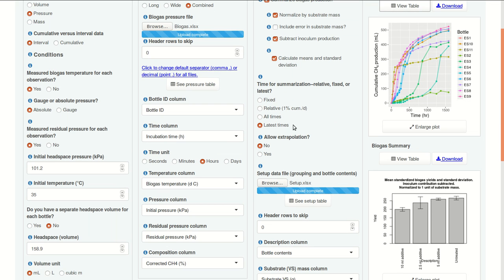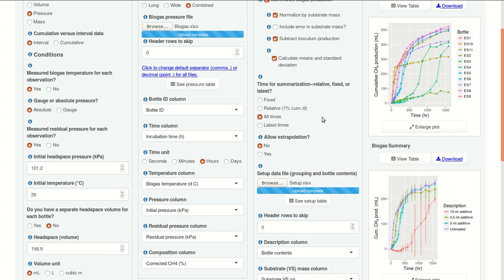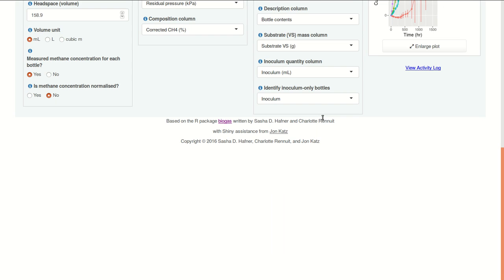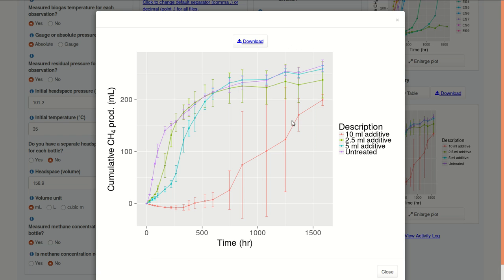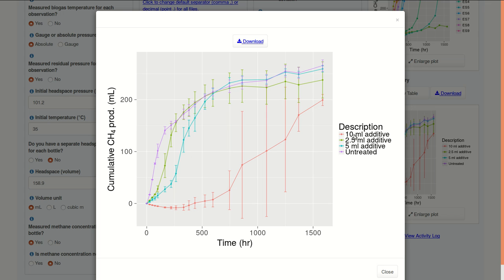If we select all times, we see something different, and I think useful. Here we have the mean response based on this description here, shown as a point and lines for the standard deviation. And we can see very different responses over time depending on whether an additive was included. So the additives seemed to inhibit biogas production early on, and that was most noticeable for 10 milliliters of additive. But here this purple line is the untreated, which had the highest rate early on.